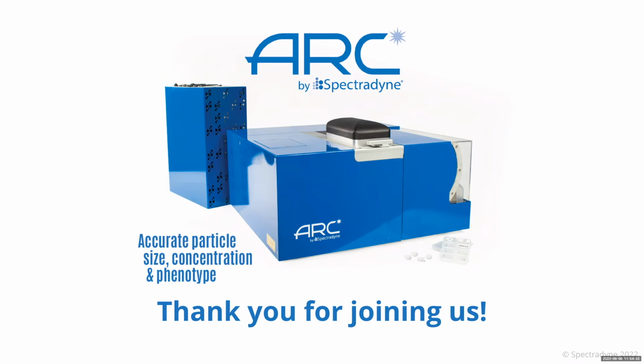And we've actually shown incidences, and there are published papers, for instance, that show that MRPS can show a change in size, for instance, on COVID from the spike protein. So the answer to that is yes, if it's detectable, we would notice the difference in size from the added size of the antibody. But it's got to be detectable. And it's all going to be relative. So if it's a 0.1% difference, you're probably not going to see it. If it's a 5% difference, you're definitely going to see it. And right. Jean-Luc, you can add to that if you want.